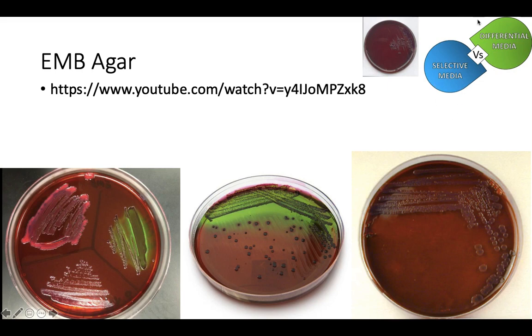Now, the differential agent in this case has to do with what these bacteria are going to do with the presence of those dyes. Now, this is kind of interestingly weird. This agar contains lactose, and technically that's the differential agent. It works on the same concept. Can you eat lactose or not? If you can eat lactose, you produce an acidic byproduct. If you can't eat lactose, you eat the proteins, producing a basic byproduct.